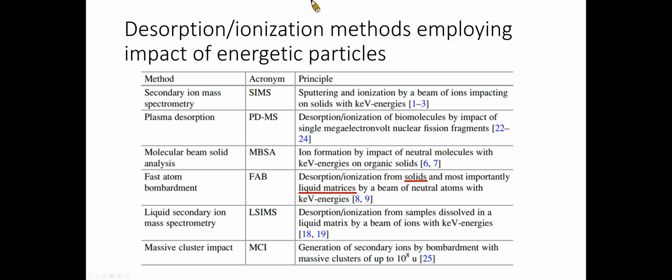In the following slides, we will go through the common desorption or ionization methods that use the impact of energetic particles, including secondary ion mass spectrometry, plasma desorption, molecular beam solid analysis, fast atom bombardment, and massive cluster impact.